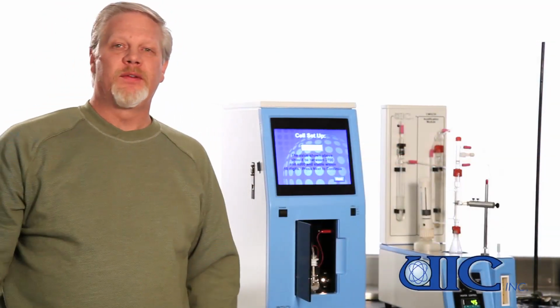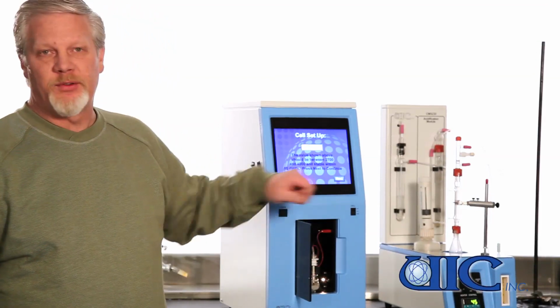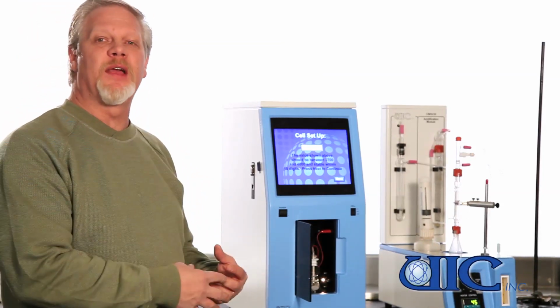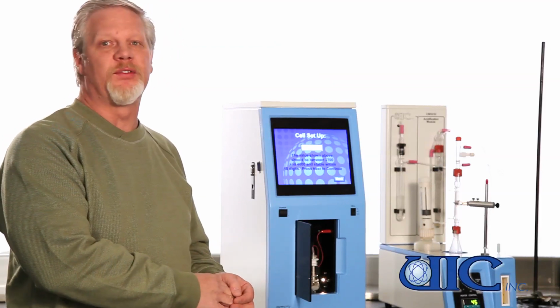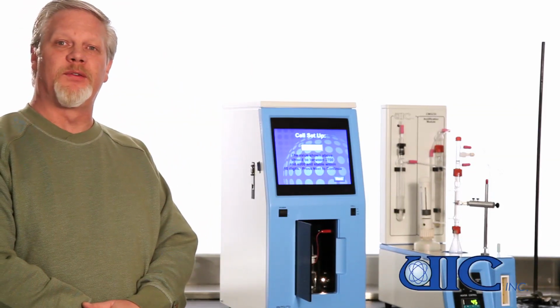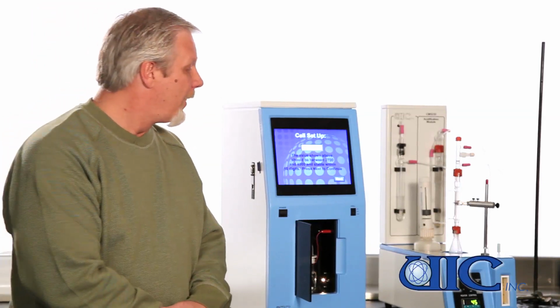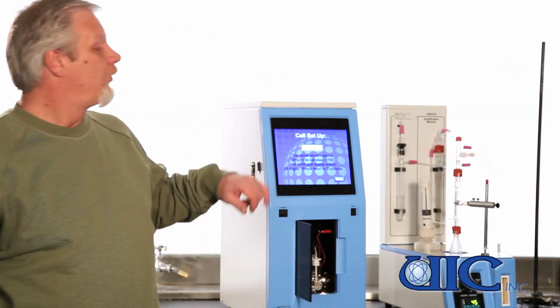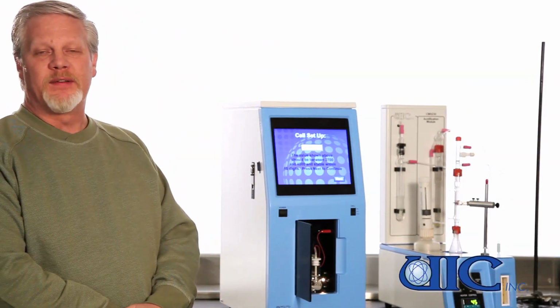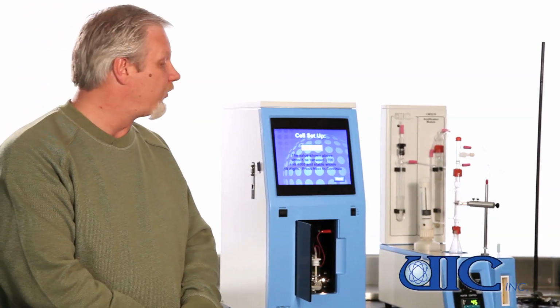The cell's now installed, with the gas lines hooked up and the electrodes hooked up. We have the cell current switch in the off position. We have the acidification module turned on so that carrier gas flow is running into the cell. We can confirm that by looking for bubbles coming into the cell inlet and that the stir bar is installed and turning. What we want to see here is we're looking at our cell setup number. We want to see a stable value within 10 digits from low to high, and the number should be between 2,700 and 4,000.